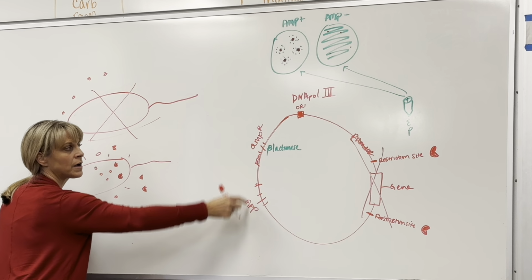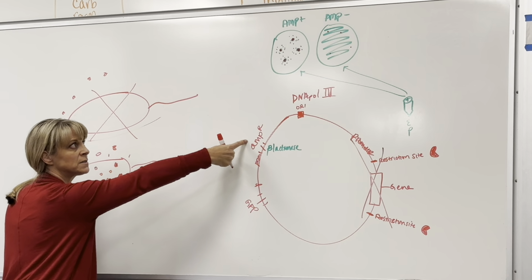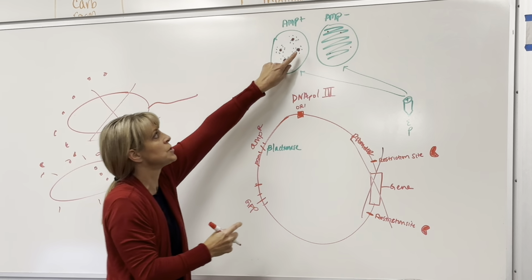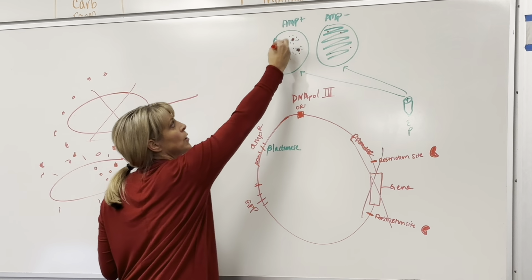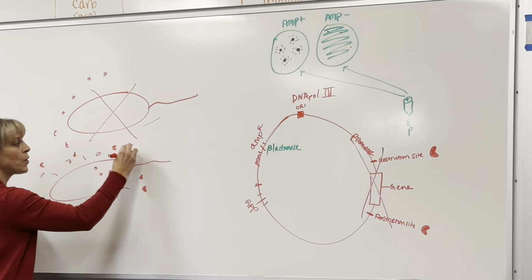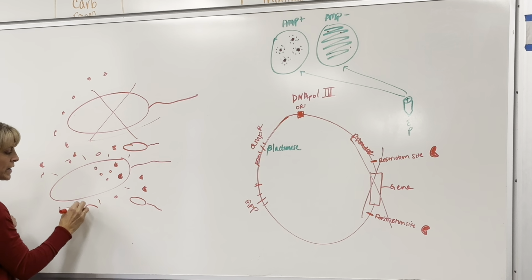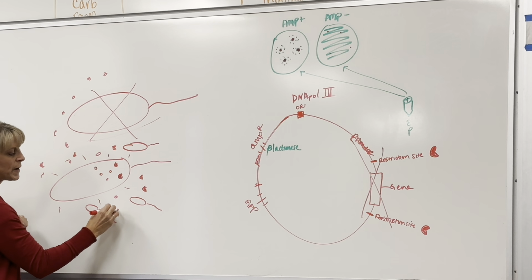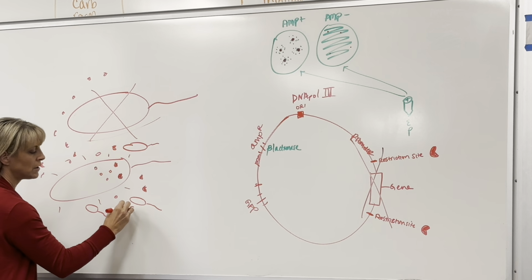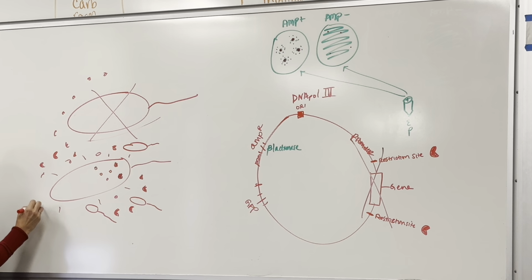These little ones around here were just able to survive. There's E. coli around here that are not very healthy, that are trying to survive because there's beta-lactamase around. So those are called satellite colonies.